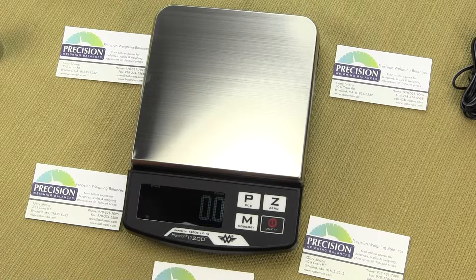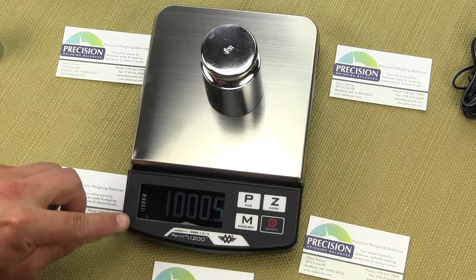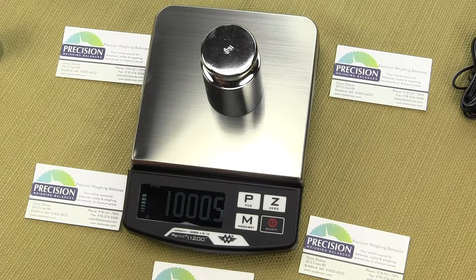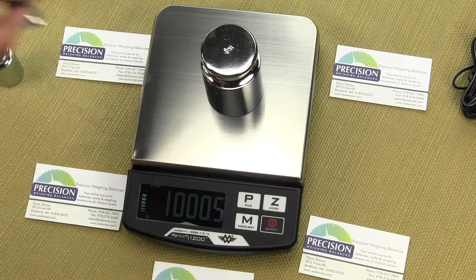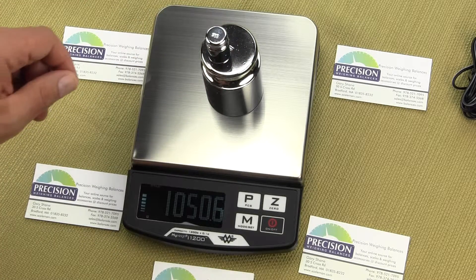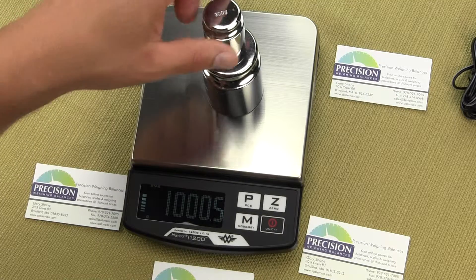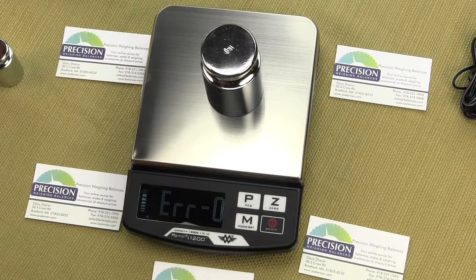We have a weigh meter in the lower left-hand corner. As we add capacity, that weigh meter increases. If we put too much weight on altogether, we're going to get an error — ER-0, which stands for overload.